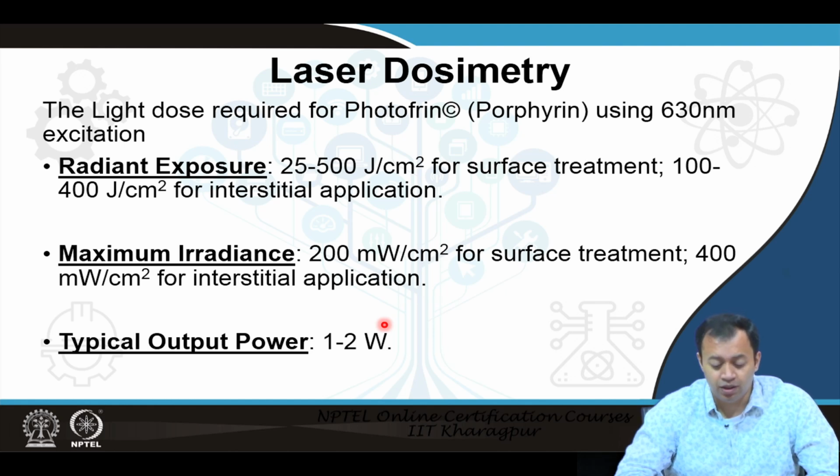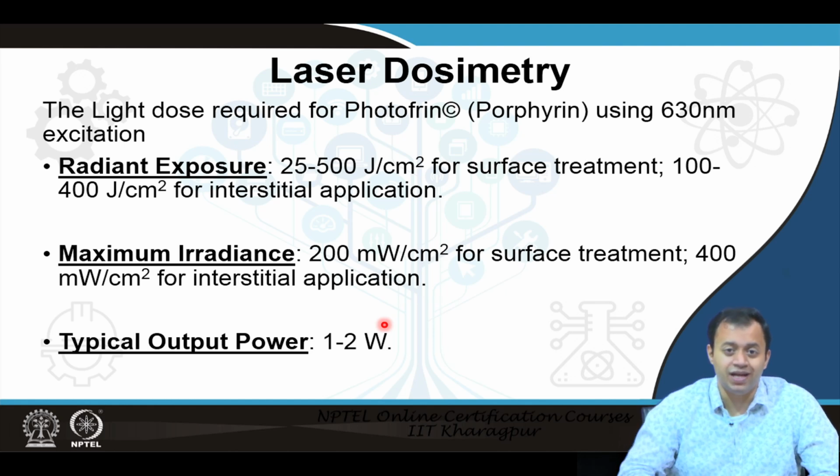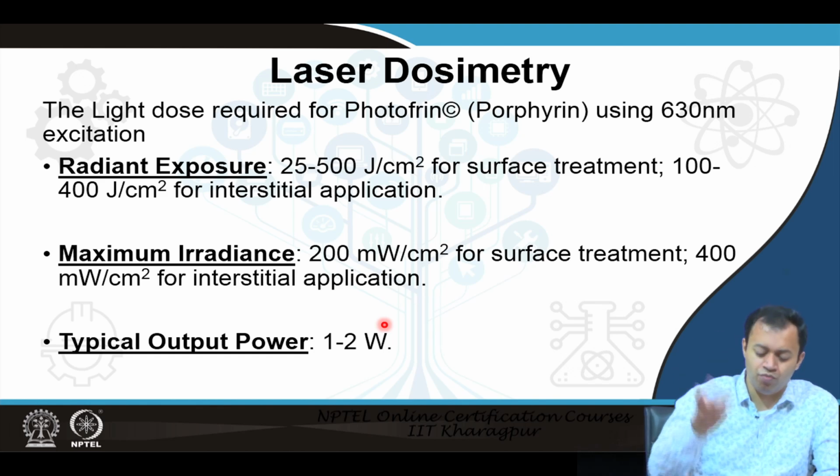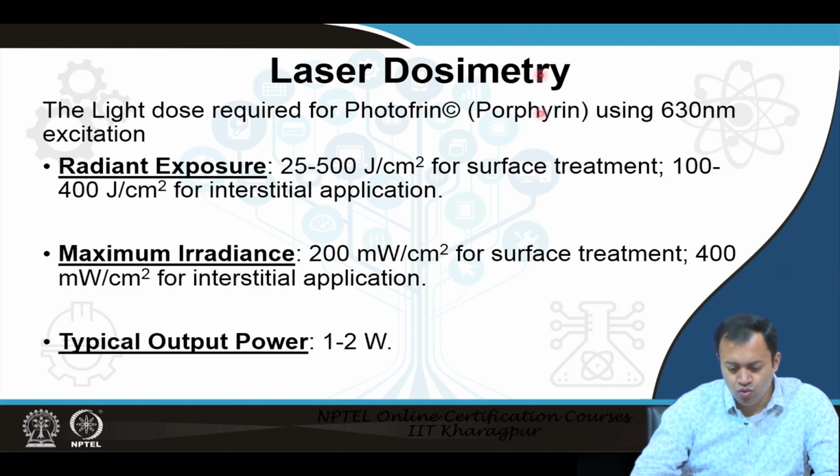but 1 to 2 watt is not exactly the power that you get out of a normal laser pointer. So you have to show more effort to actually do the experiment. So this is the overall protocol.